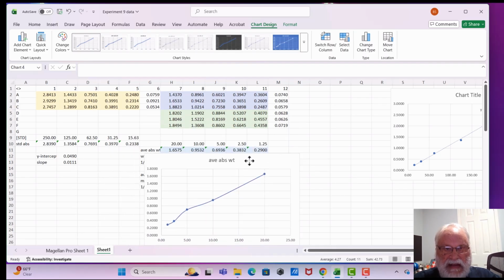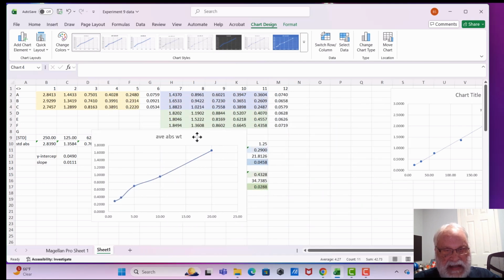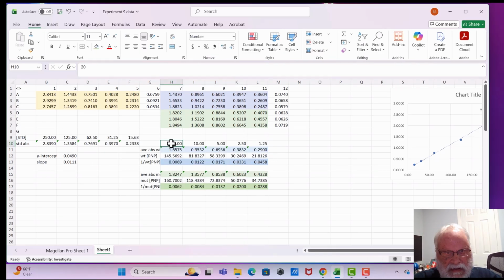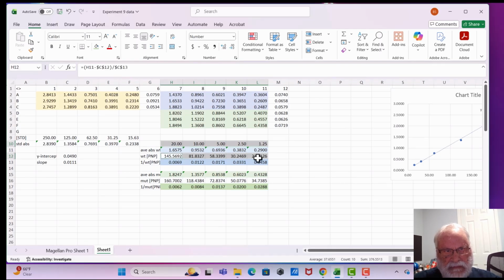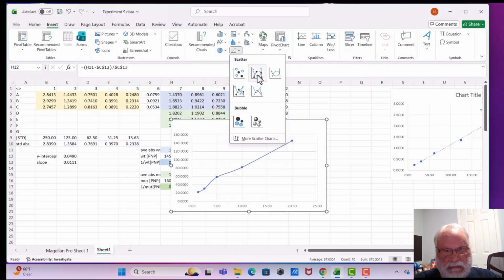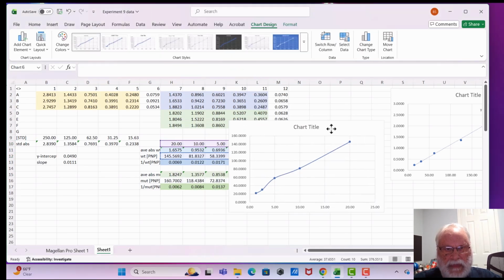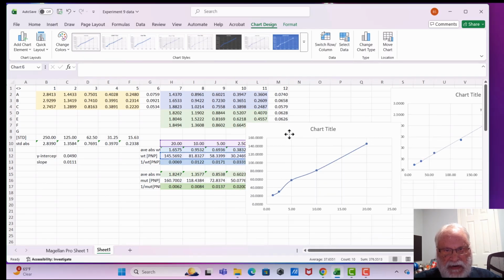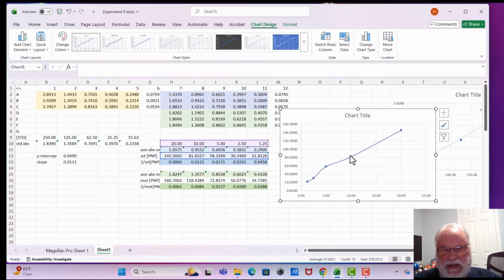And in reality, I made a mistake. Even though the graph will look just the same, let's go ahead and delete it. Okay, there we go. So we highlight only those areas, and we'll put in some of that information a little bit later. So we have that. So we know this one, the blue, is going to be wild type.